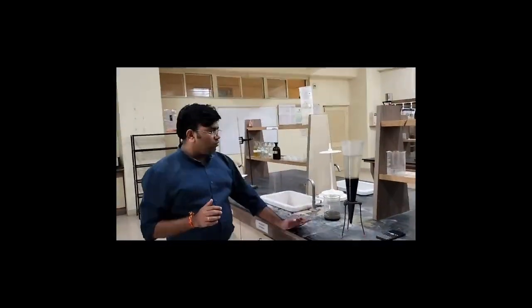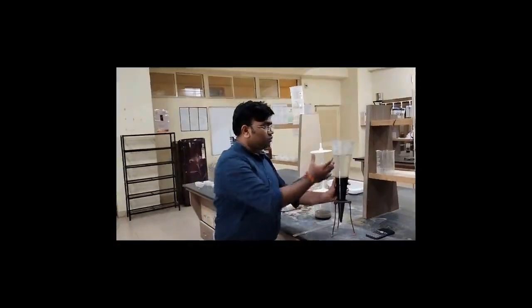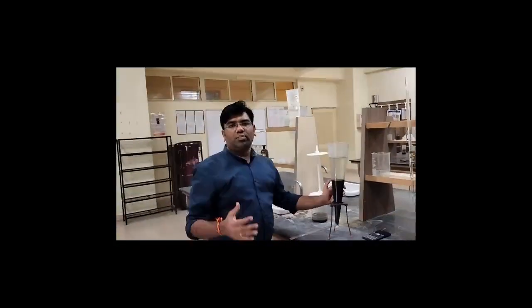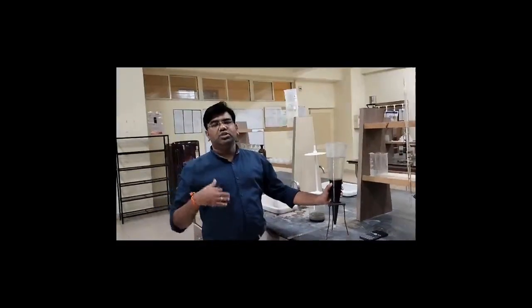We are going to find out MLTS, that is mixed liquor total solids. We are going to subtract MLDS, that is mixed liquor dissolved solids, from MLTS, and then we are going to get the MLSS. So for the same sample, we are going to find out the MLTS, that is mixed liquor total solids, and mixed liquor dissolved solids. The procedure remains the same. The same procedure that we applied for finding out the total solids and the total dissolved solids is going to be repeated here.